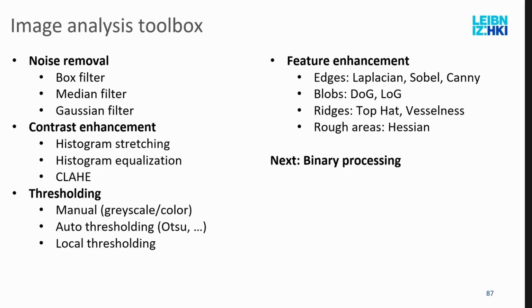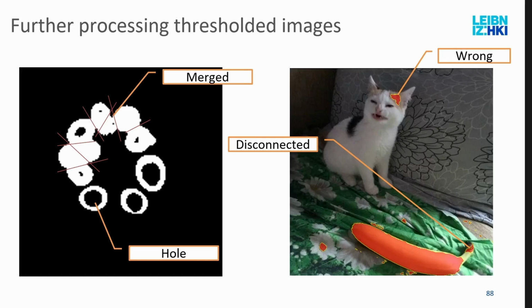So, you might have a binary image that comes out through thresholding, but it's often not perfect. Sometimes you have clusters, stuff that merged and you rather want apart. Sometimes there are holes inside that you don't want, because you want the cell filled out.